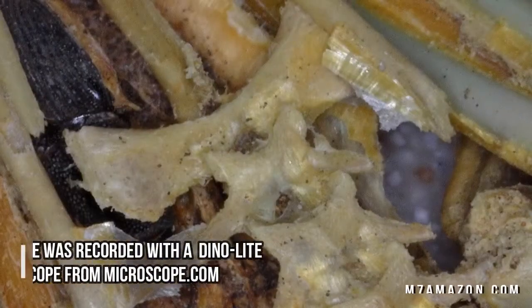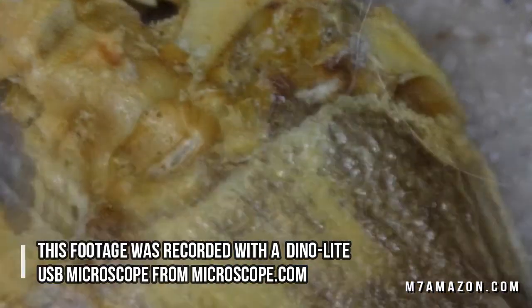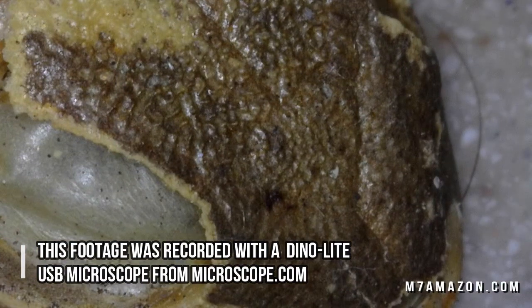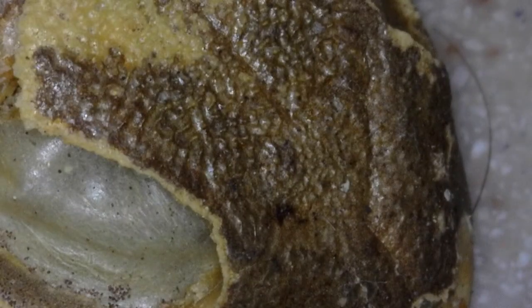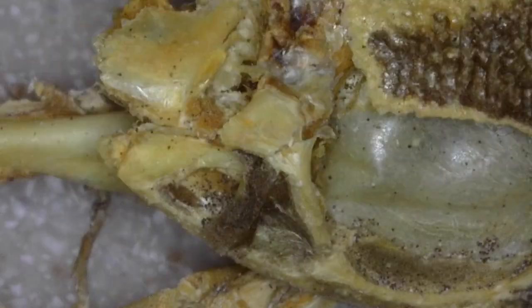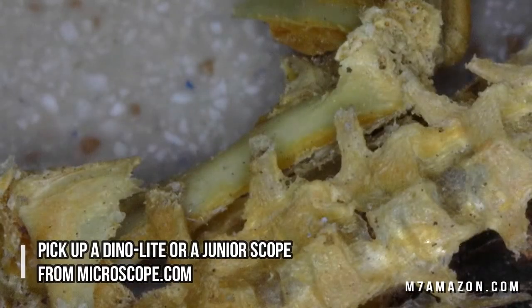All right folks, so the story about this frog is apparently it was living in my garage, died up in the rafters, and I found it there probably a year or so afterwards. All that remained was this very unique frog skeleton. You can see its face and its eye orbital socket, and in a moment we're going to check out its backbone, which is really interesting to see how similar in structure the backbone is to that of a human.